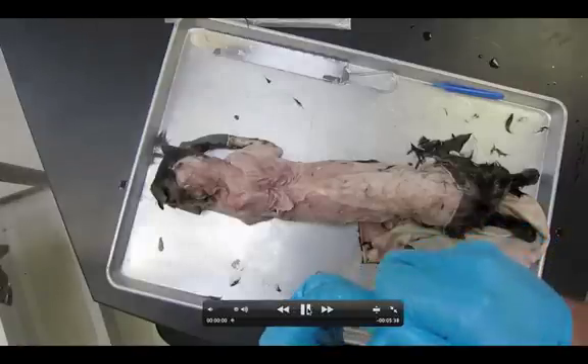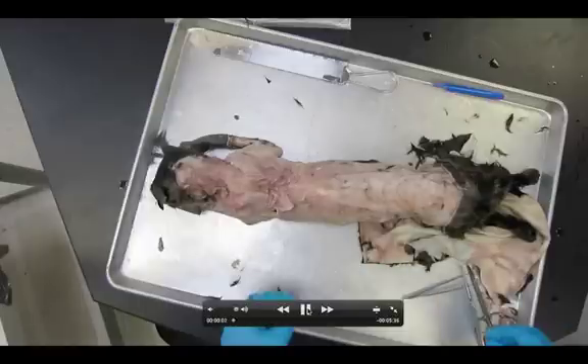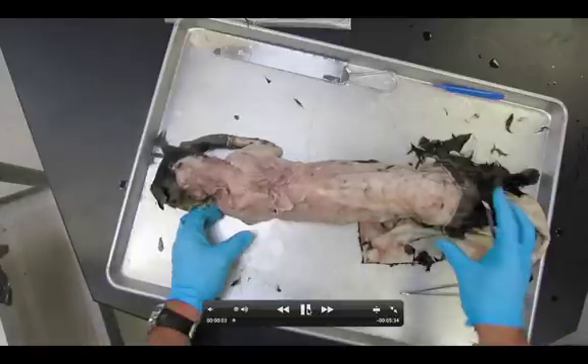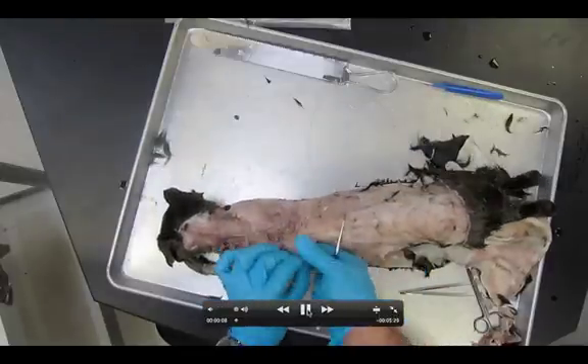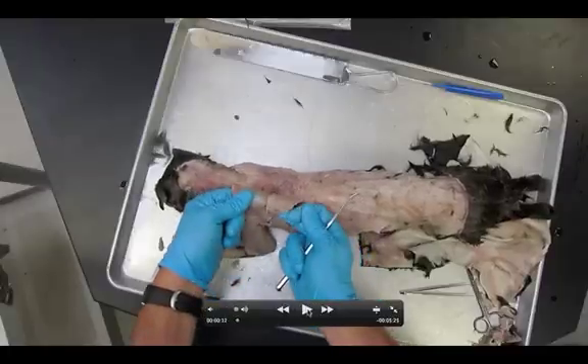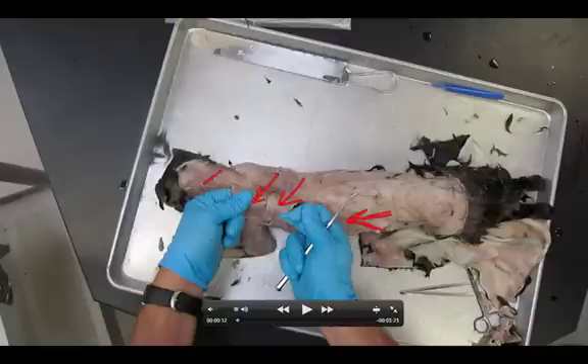For this dissection video, which is dissection number two — the deeper muscles of the back and shoulder — as you can see on this cat, we have already done some of the dissections for dissection one. We have the latissimus dorsi, the spinotrapezius, the acromiotrapezius, and up here the clavotrapezius. All four of these muscles are going to get cut in this dissection.